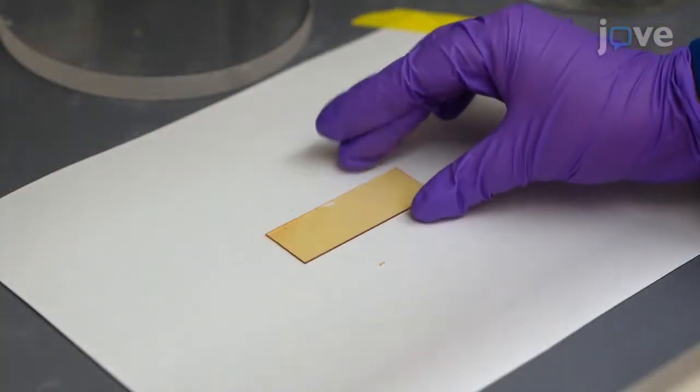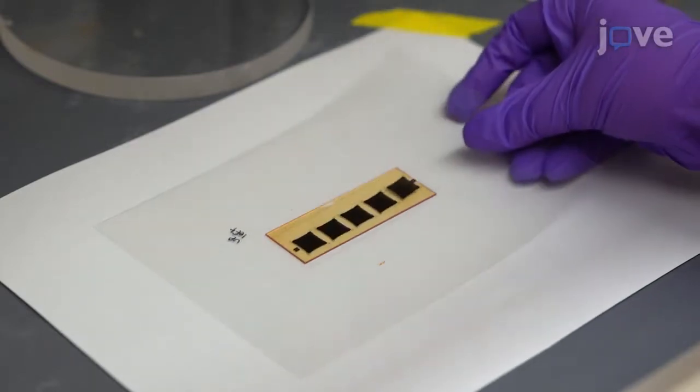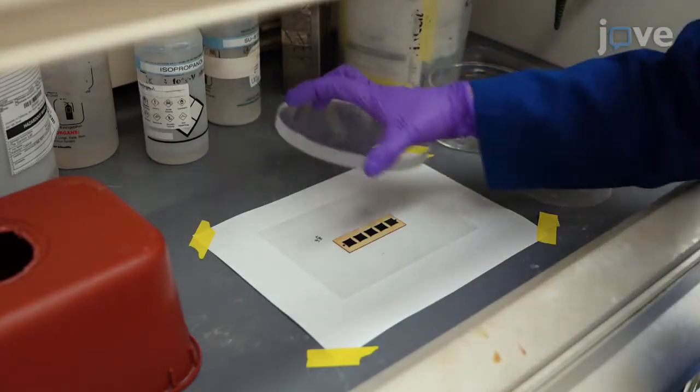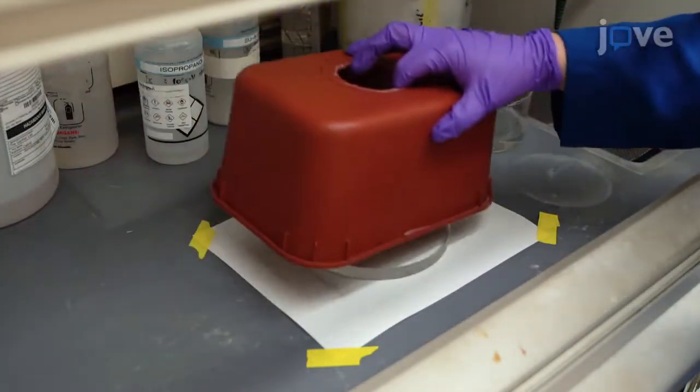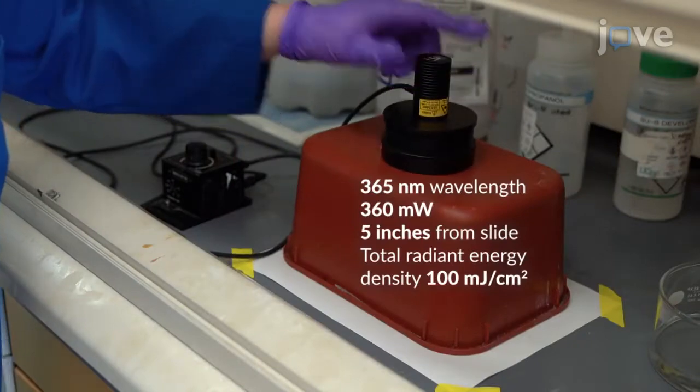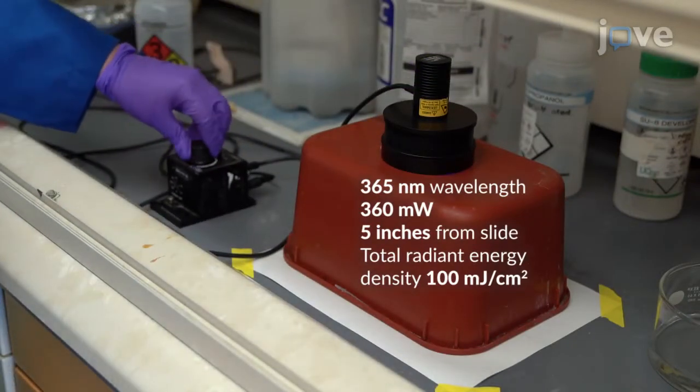Remove the slide from the hot plate and place a photomask with the desired features on top of the slide. Weigh it down with a piece of glass and cover the entire setup in an opaque box. Expose the setup with a UV lamp for 2 minutes.